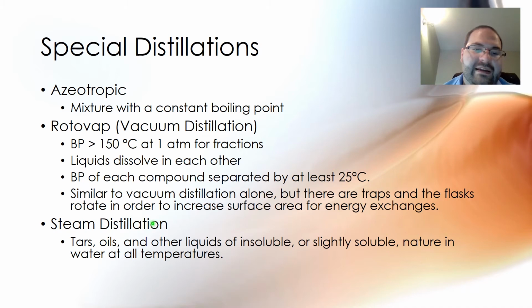As far as steam distillation is concerned, because I mentioned that it is a type of distillation that's special that you can use, predominantly it's used for separating tars, oils, and liquids that aren't very soluble together most of the time. Some of them are, but there's a phase in there that's not. So if it's something like water, which comes from steam as well, the compounds that you're distilling with it may not be soluble in it, or they may be very, very slightly soluble, but not extremely soluble. And so in those cases, steam distillation is used.